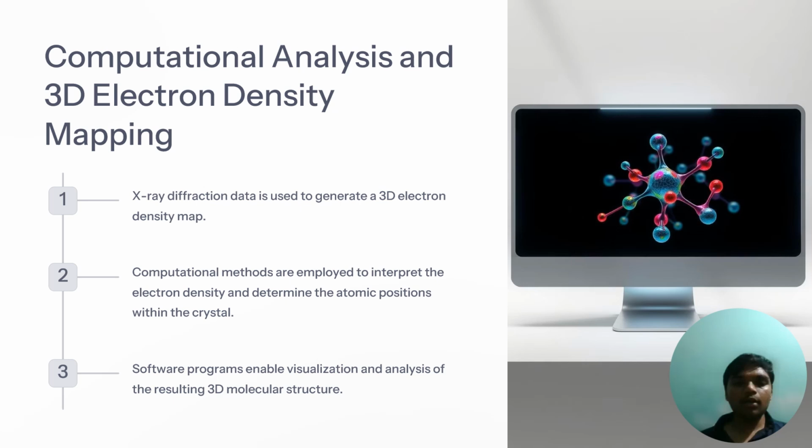This information is important because the crystalline morphology influences the material's physical properties such as its melting point, hardness, and resistance to solvents.